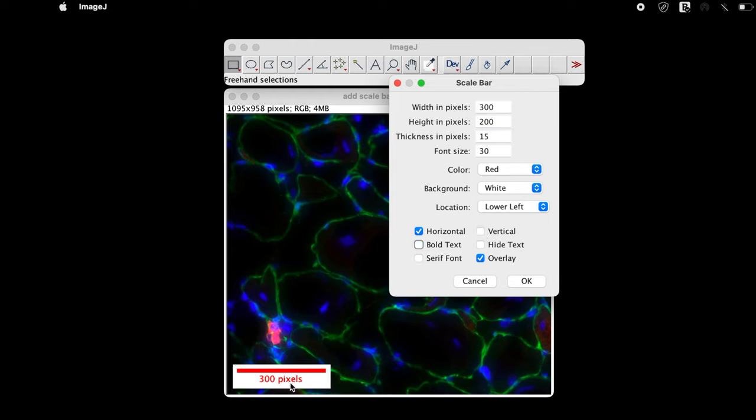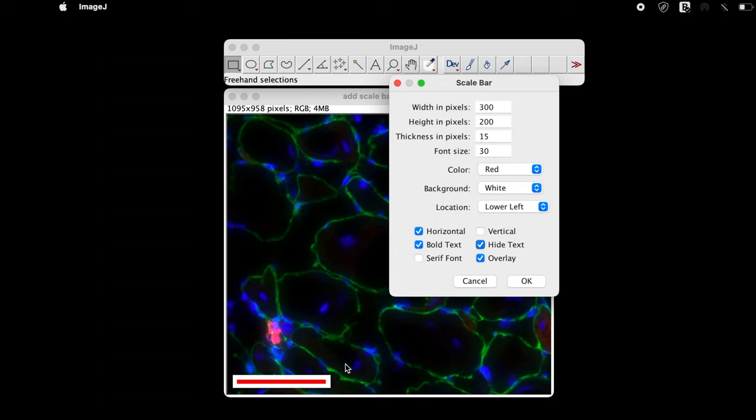The other parameters that can be used to modify the scale bar are to change the text style and font. One can also choose not to display the text. Check on hide text and only the scale bar will be displayed. The overlay option may or may not be selected.